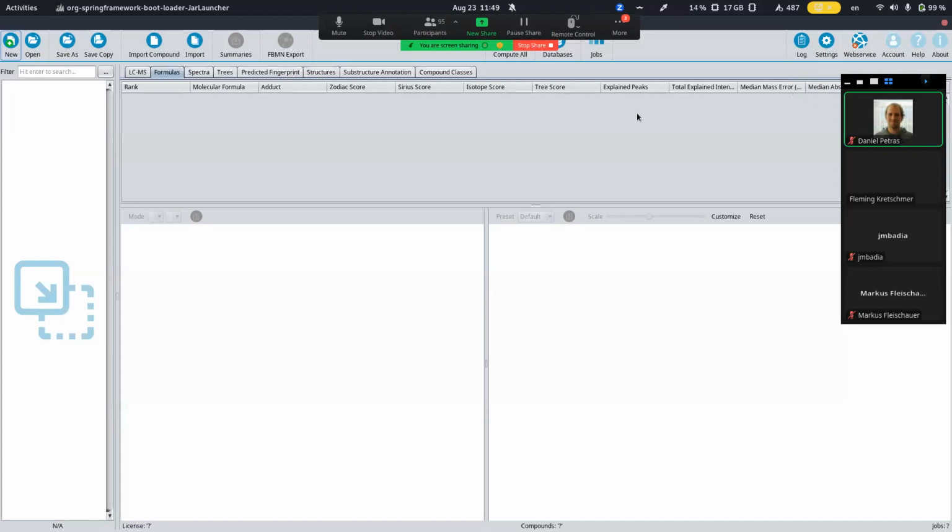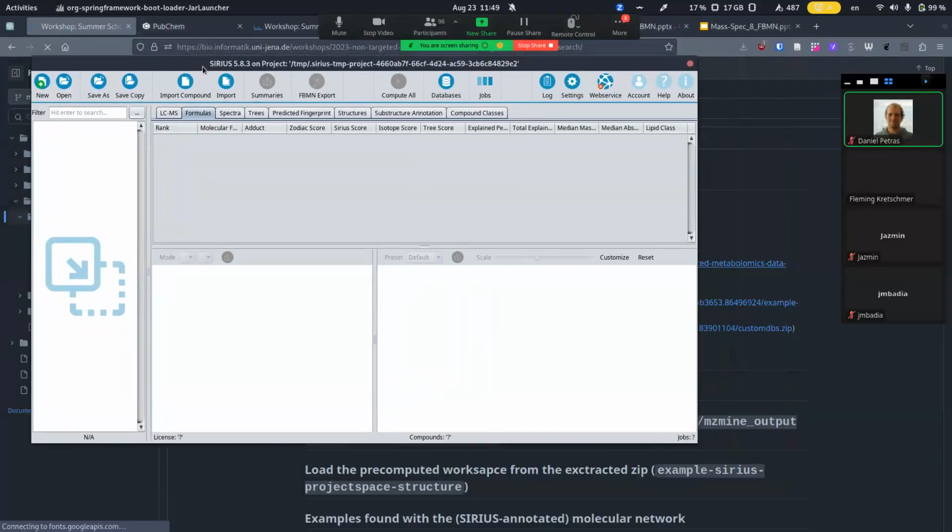Let's just do it. I mean, you can see, especially if I just make the window a little bit smaller, you should be able to see everything. Definitely decrease, like take the minus on the filters on the zoom on the right. Yeah, of course. Yeah, sorry. At least now we can see a little bit more. And unfortunately, our homepage is not loading right now, but we still have time to maybe give you a quick tour on the main buttons you see in Sirius.